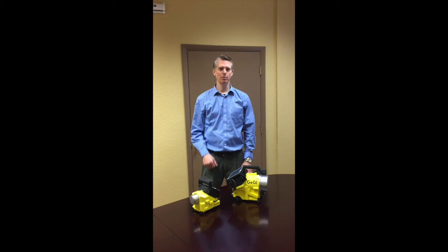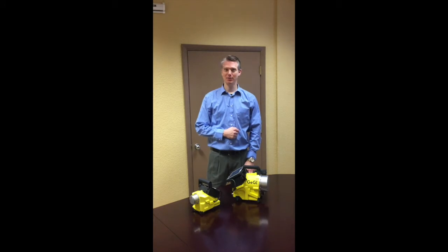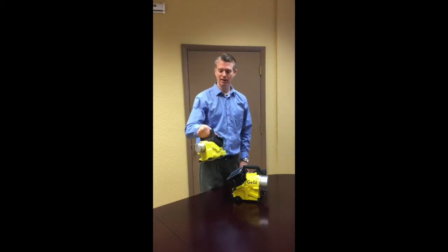Hi there. I'm Ethan Hull from PHDS Corporation. I'm here today to introduce you to our very latest germanium gamma ray detectors. Starting off, we have the Fulcrum, a 7-pound high purity germanium detector system.